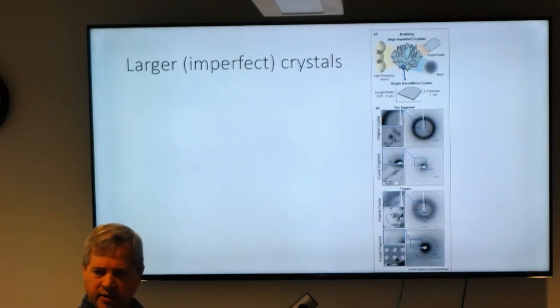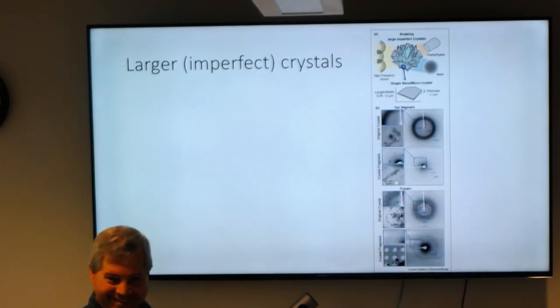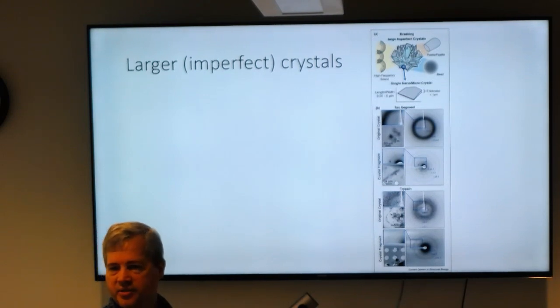Are you at Cornell, or are you? No, Princeton. Oh, okay. You have a Cryo. I know you have a lot of microscopes there. Okay, we have a Talos, I think, that would be used for that. Yeah. People are just starting to think about doing it. Yeah, so if you have the CETA camera on that, it has rolling shutter mode. And they make a CETA-D camera now, which they call hardened for diffraction too. I'm not sure how necessary that is.